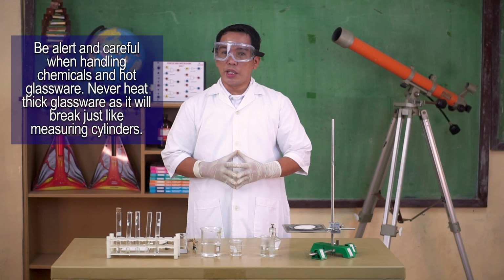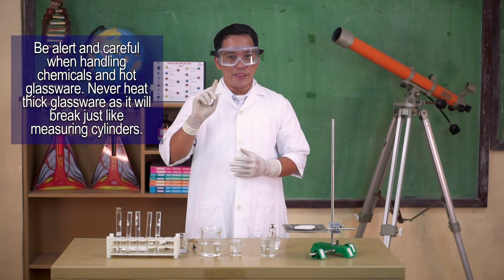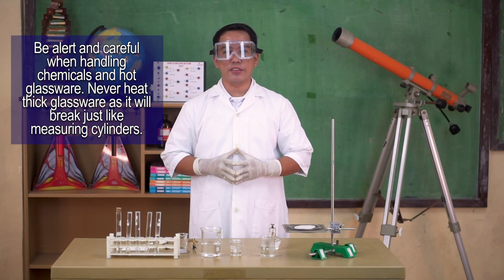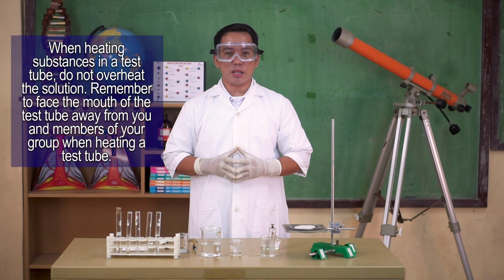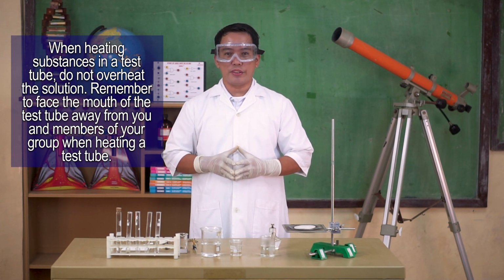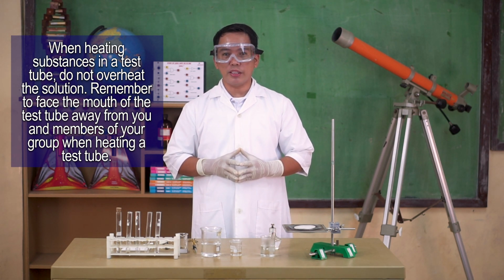Be alert and careful when handling chemicals and hot glassware. Never heat thick glassware as it will break just like measuring cylinders. When heating substances in a test tube, do not overheat the solution. Remember to face the mouth of the test tube away from you and members of your group when heating a test tube.